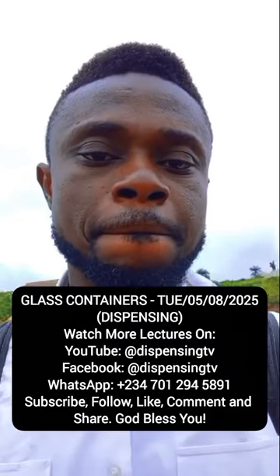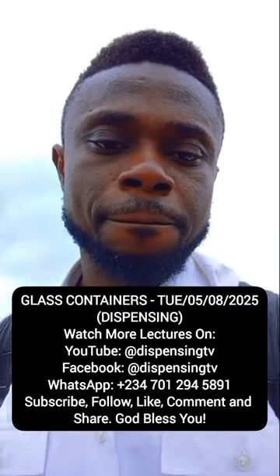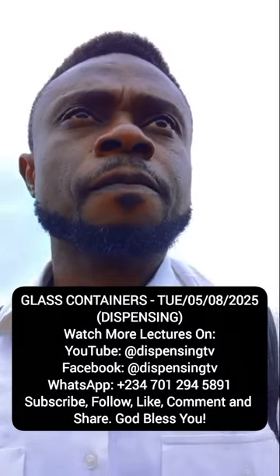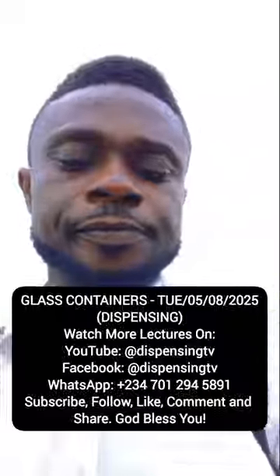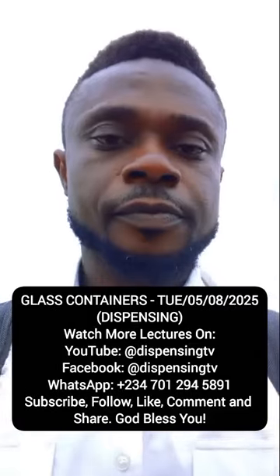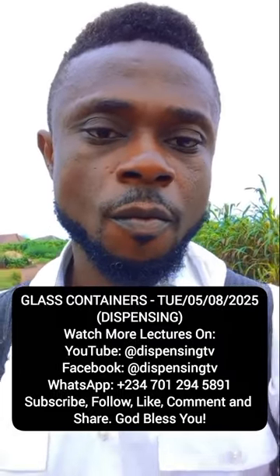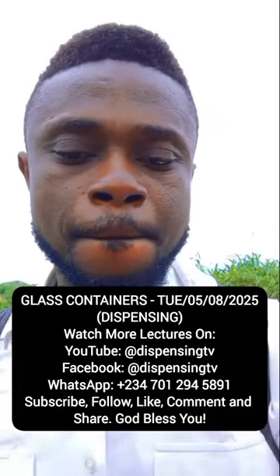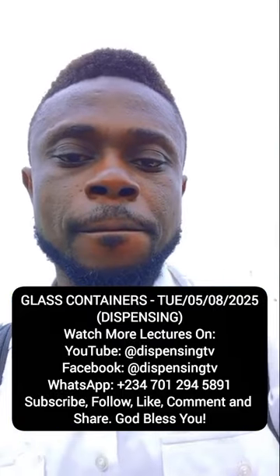In pharmacy, any bottle you see that is ribbed like this, touch it, it's not smooth, it's ribbed. What it means is that the content should not be used for internal use, orally. It means that it should be used externally. So that even a blind man, if he touches it and it's ribbed, that's the meaning. It will send a signal to the blind man that this thing should not be taken. Is that clear? Yes, sir. That is a standard in pharmacy, in dispensing.